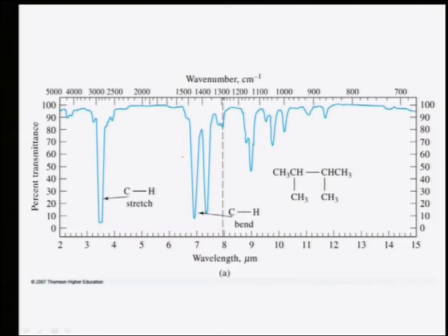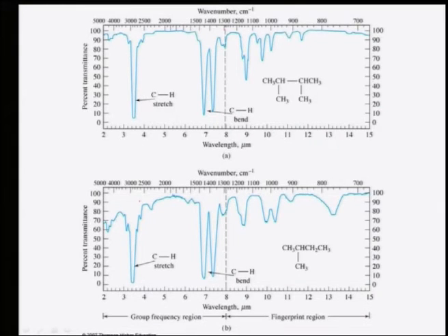To give you some more idea, this is taken from this kind of compound. You can clearly see there are 1, 2, 3, 4 methyl groups and CH bonds and CC bonds. So if I take an FTIR spectrum from this, we get the CH stretch band at a wave number of approximately 3.5 micron in wavelength. This is actually plotted in terms of wavelength lambda. And then you have CH bends. Bending can also lead to bands, and then you have many other frequency bands. So by looking at these bands, we can carefully say what it is.